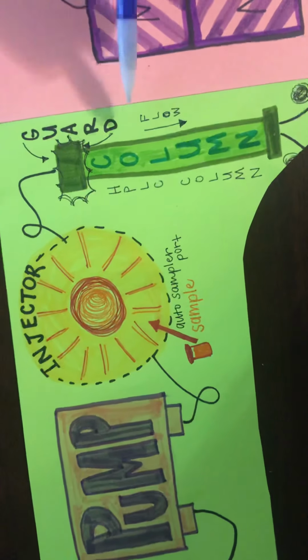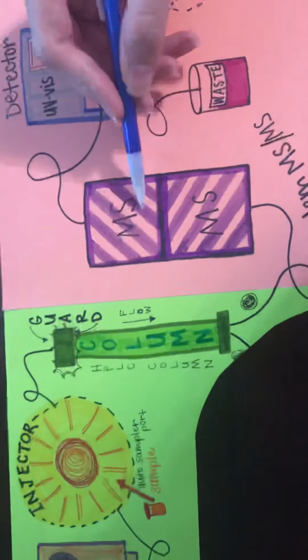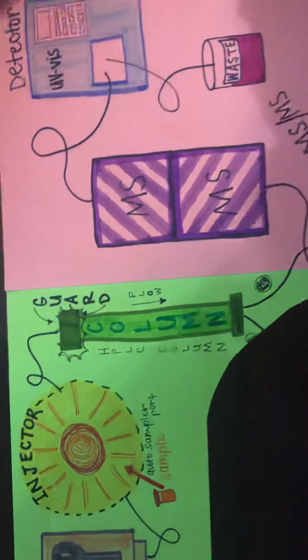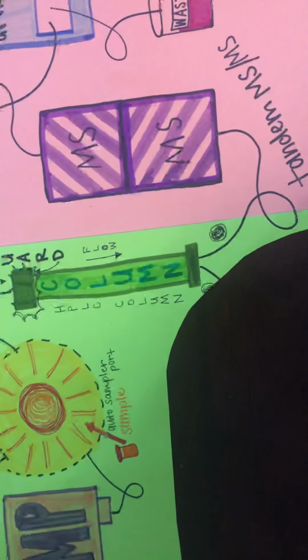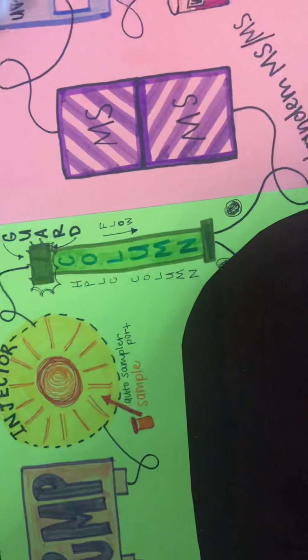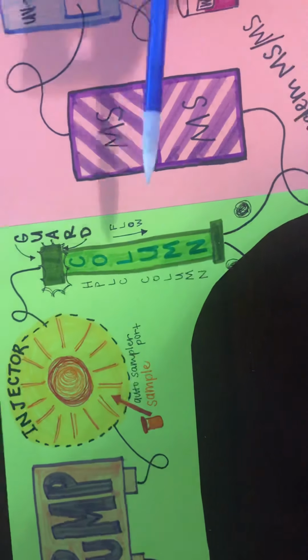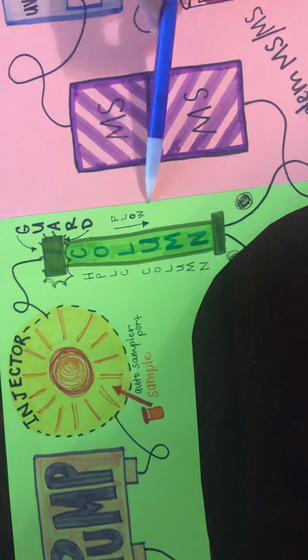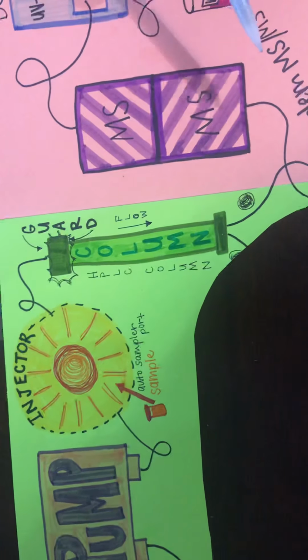And so from our column, we're going to flow to our tandem mass spectrometers, our MS. They are in a series, that's how they're connected. And the MS is placed after our HPLC because the HPLC is going to separate our components first, and the MS will tell us the molecular weights of our components.